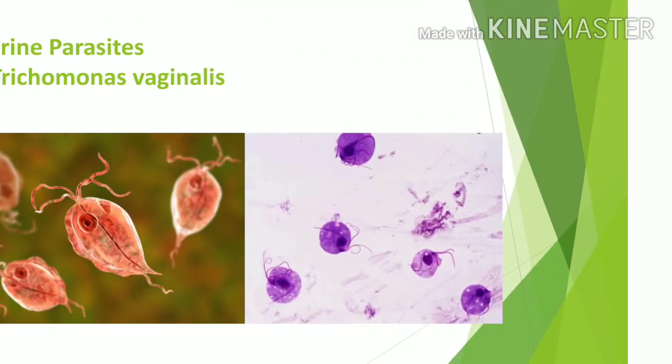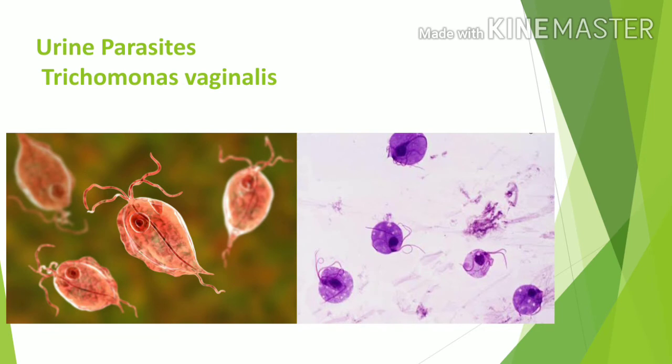Then urinary parasites. In this picture, Trichomonas vaginalis is shown. This is spread through sexually transmitted diseases. It is identified under the microscope — flagella are present in this organism and it moves speedily to other fields.